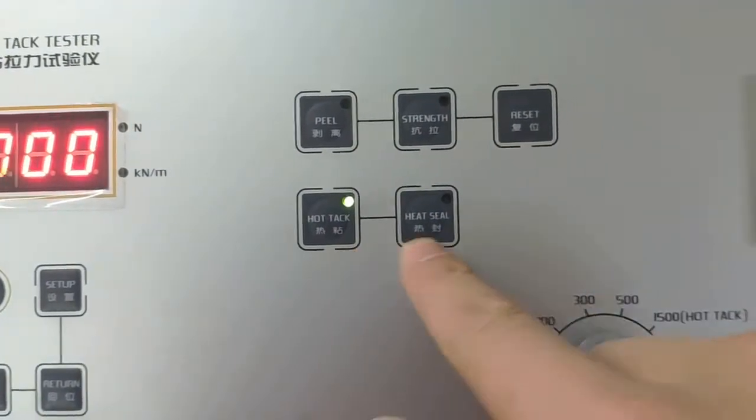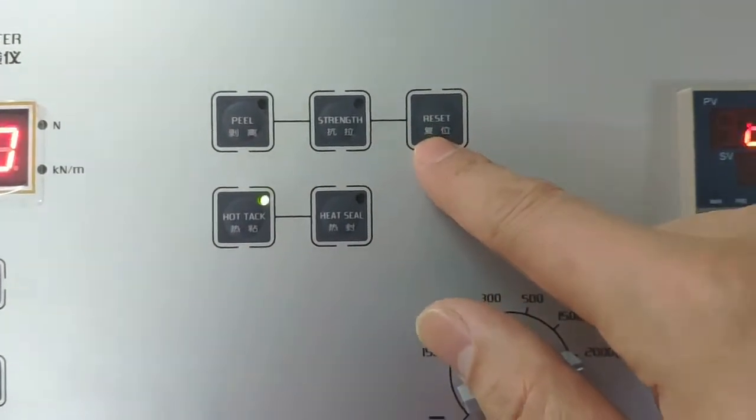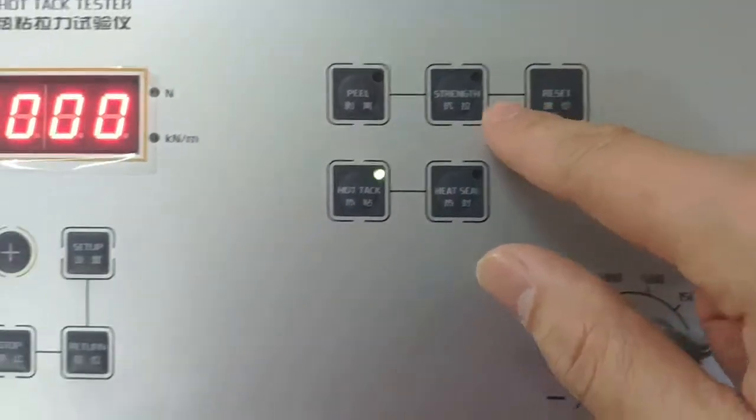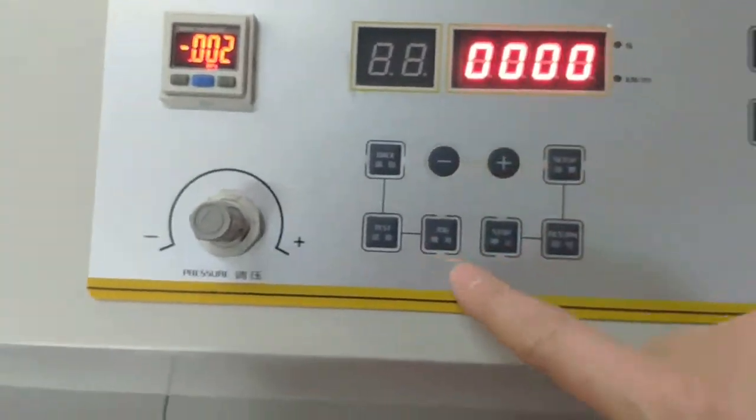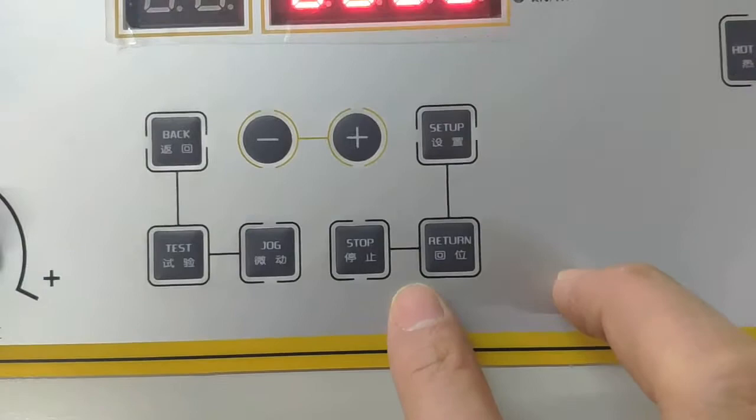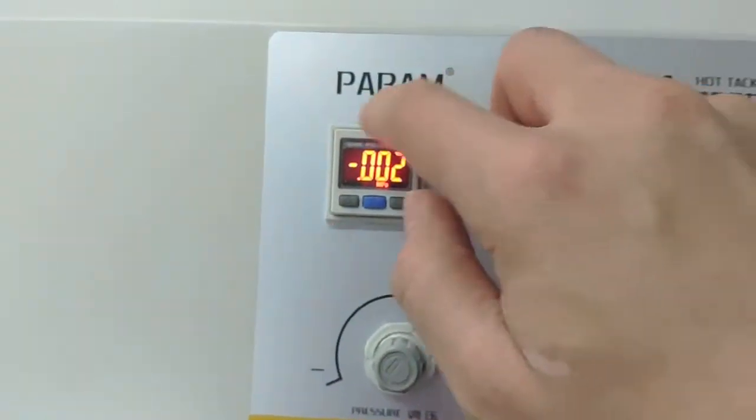These are the buttons for selecting different test modes. This instrument can do peel, tensile, hot tack, and heat seal. The reset button helps you recover from system error. This is the display and these are the buttons for different operations.